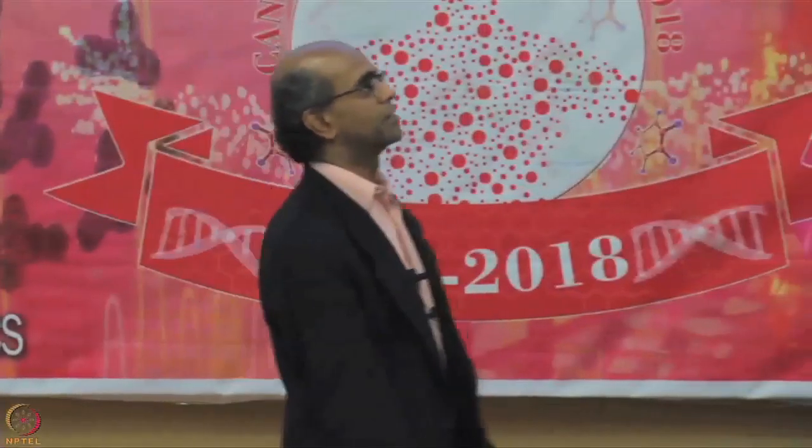So, the next topic in this set of slides is batch correction. We just talked about normalization, where we are trying to make all the samples similar. I don't know how many of you have heard of batch correction, just a few. Batch correction is something you apply when you have different batches of experiments you did, and you think there might be a difference between those batches.